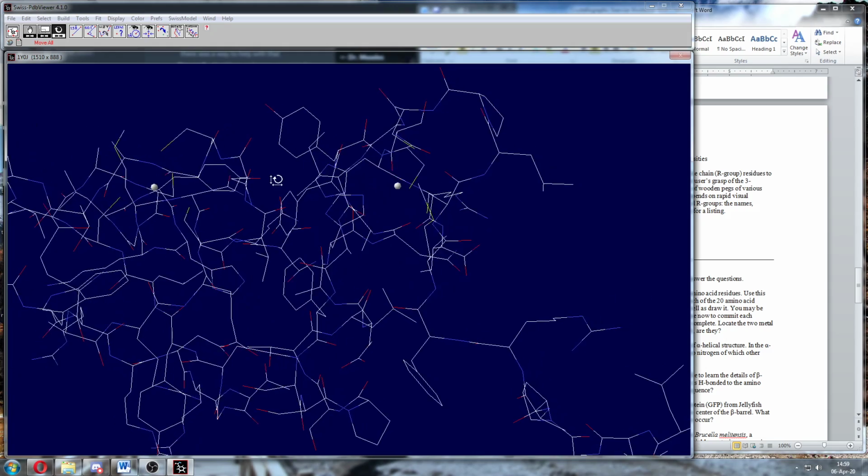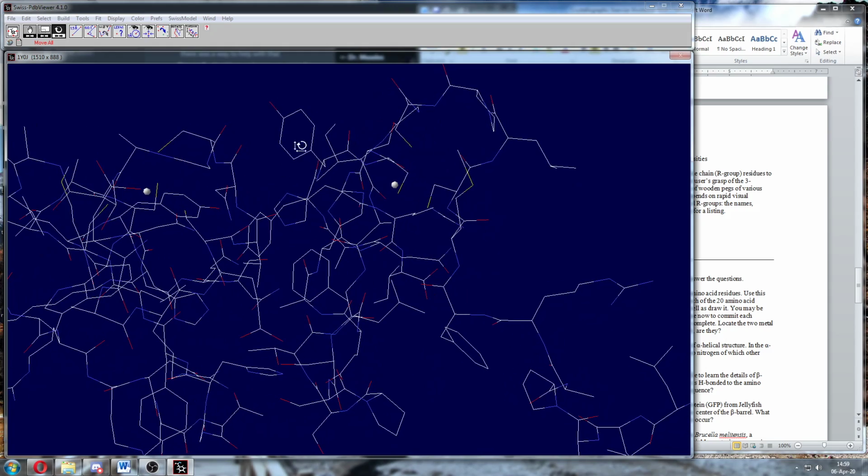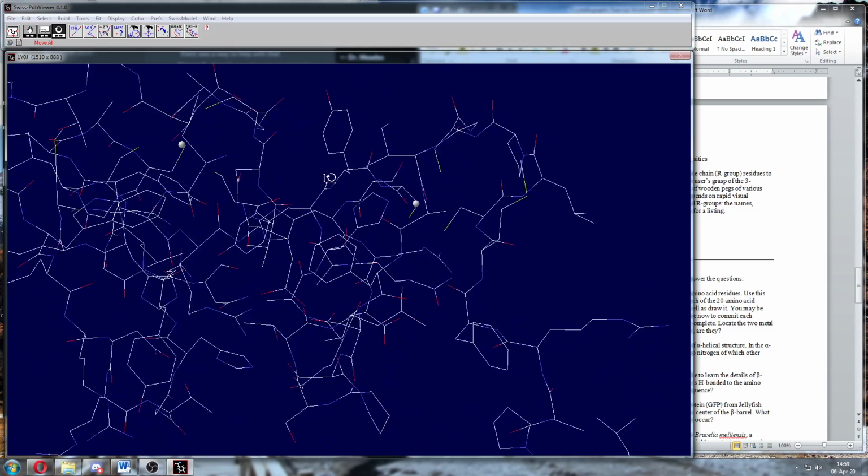We've done this one already. Which one are we looking at? Excuse me? Which one are we looking at? Oh, so you can't see my mouse. I'm sorry. Let me put it at the very top of the screen for you, in the center.